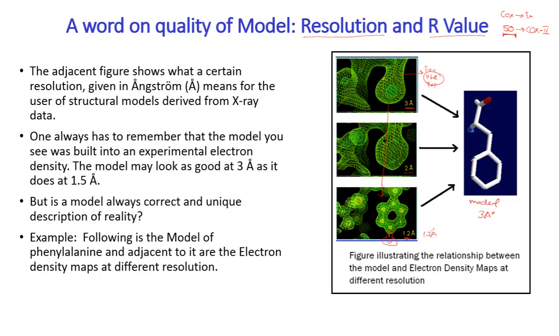You can rely on the quality of the model. One more thing I would like to explain is that the higher the value of resolution, the model is not that good.